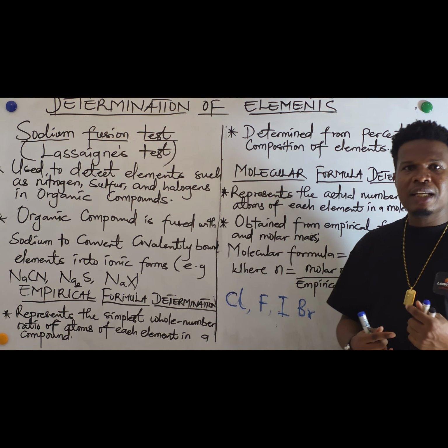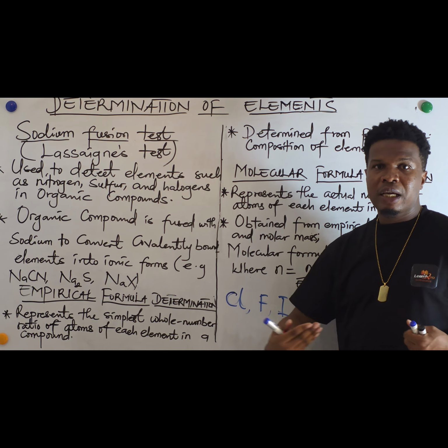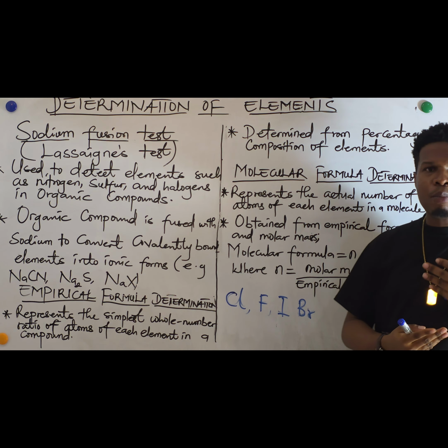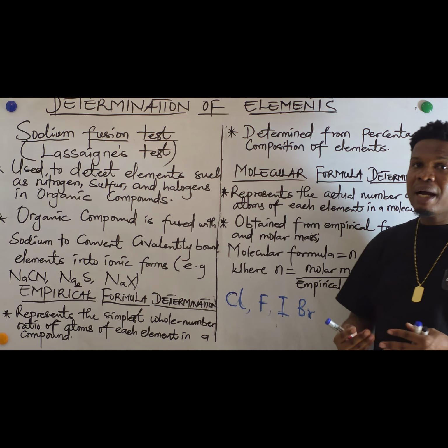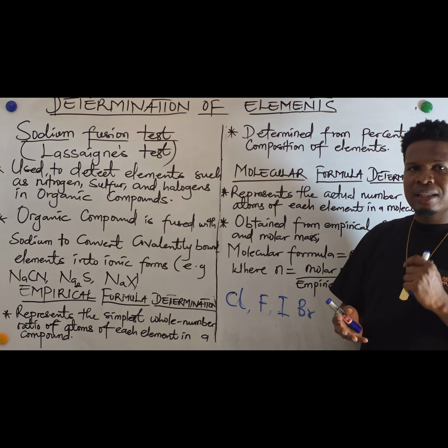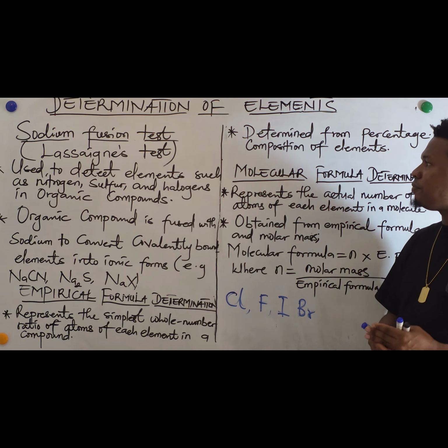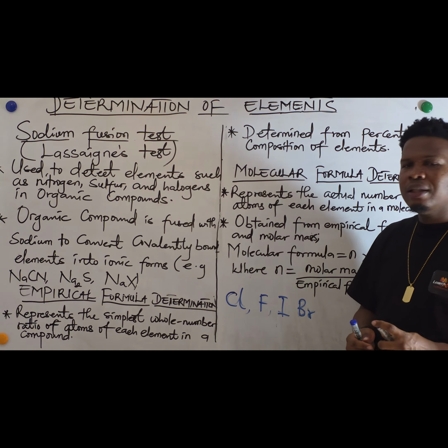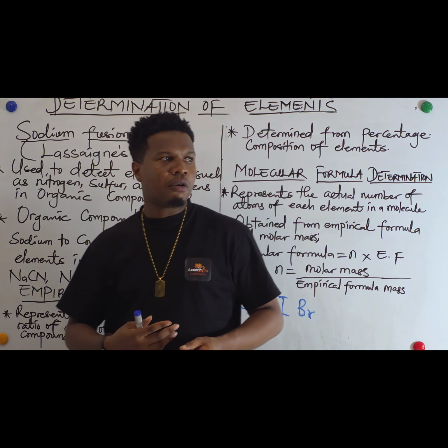So this is an important test that we use to determine elements such as nitrogen, sulfur, and other halogens.